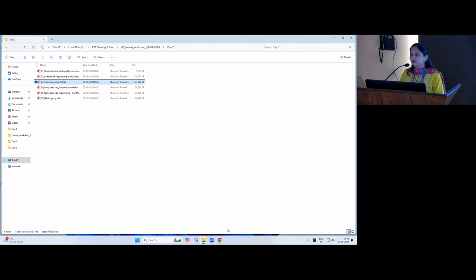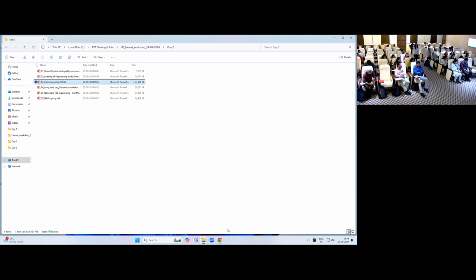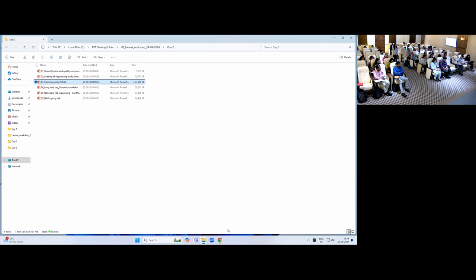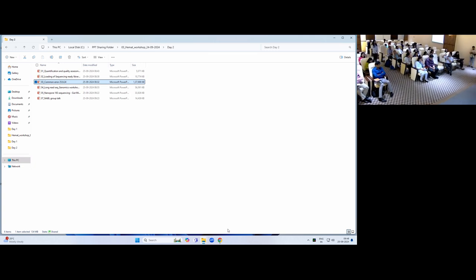As I showed yesterday, every Illumina library has Illumina sequencing binding motifs. I mentioned yesterday that inside the flow cell there are primers that bind to the standard Illumina library, from where the sequencing process starts, because without that sequencing cannot proceed. The primer has to bind, after which there can be addition of bases.